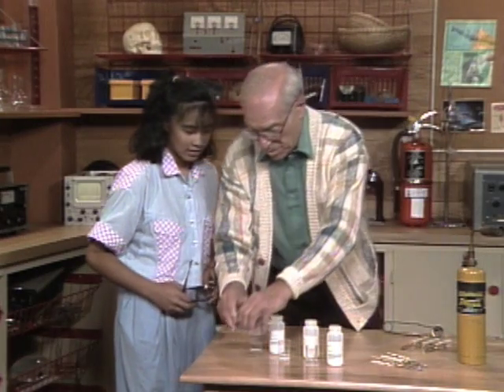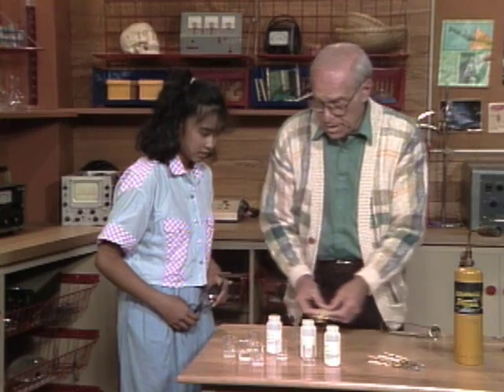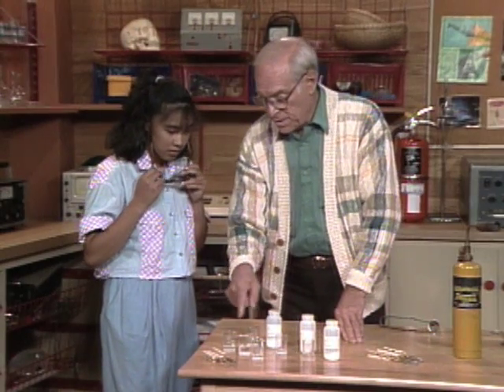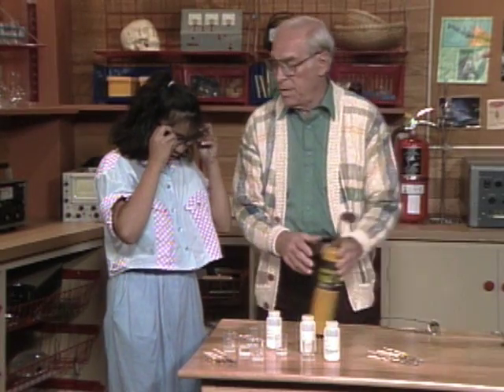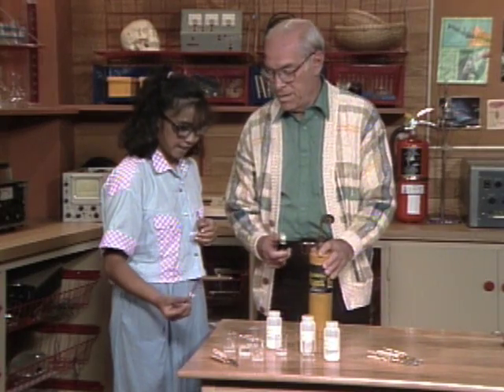Here are three more unknowns and three clean probes. I would like you to tell me which of these three unknowns is which. How are you going to do it? Just dip them in and identify them by the color, right?